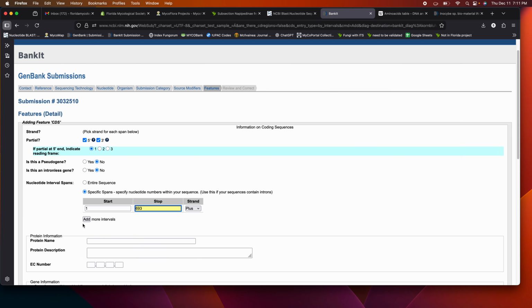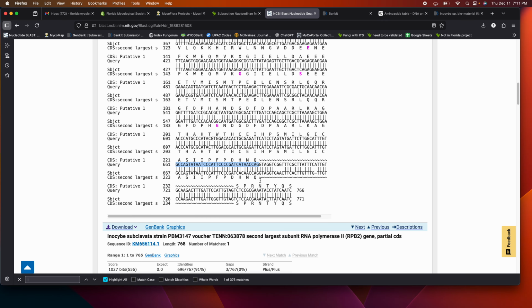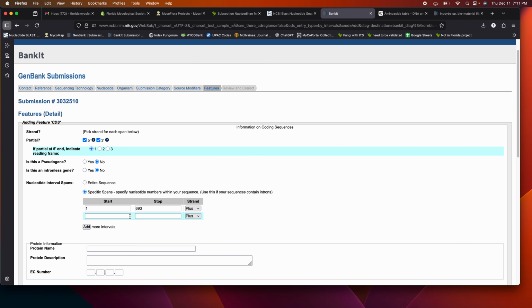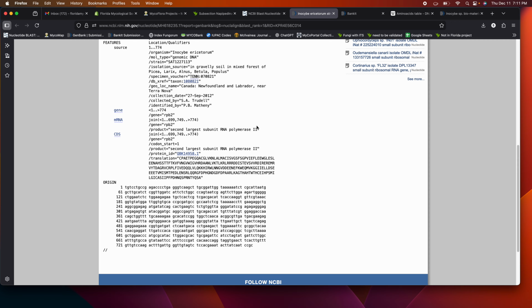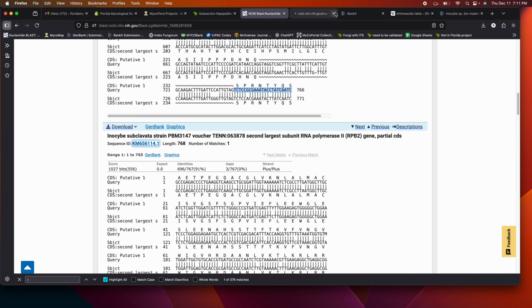And then I'm going to go back, and then I'm going to highlight where it starts again at that T, which is 744, and it goes to 766. So 744, 766, and then just to make it quick, I'm going to open up the session for this guy. I don't like what that says. We're going to go to the next one.